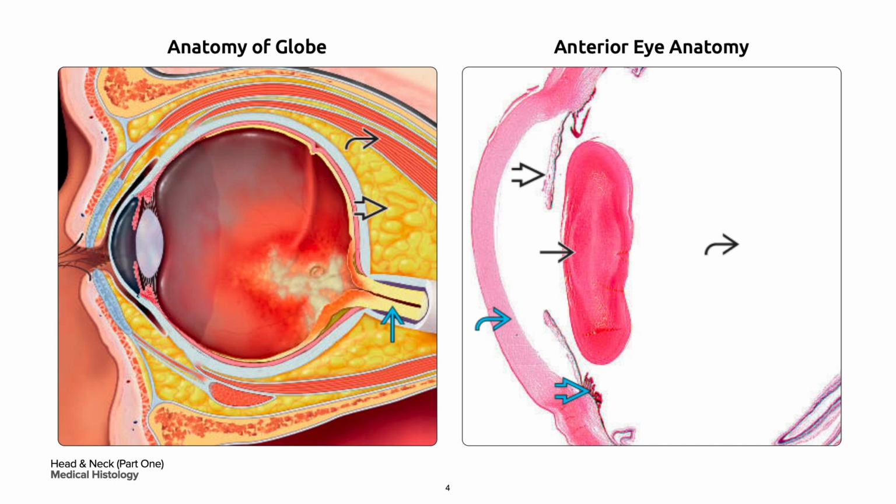On your right, in this sagittal section, we have your cornea, which is in a curved blue arrow, your iris in bold black arrow, the lens, single black arrow, the vitreous body in curved black arrow, and the ciliary body in bold blue arrow can be identified. The anterior chamber is the space between the anterior iris and the posterior cornea, and the posterior chamber is here on your right, comprising the space between the vitreous and the posterior aspect of the iris.